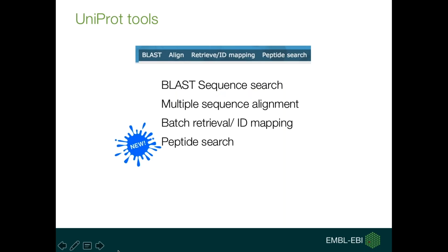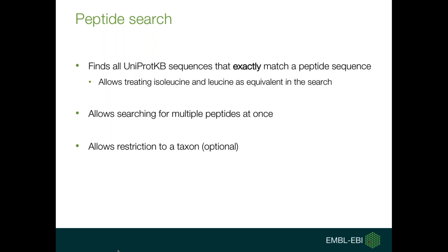Having set the stage with this introduction about proteomics data in UniProt, I'd like to move on to the novelty of the peptide search tool that we've added recently to our website. This tool is added to the small complement of tools that we routinely present on the UniProt website. You find it in the top-left corner of any entry on the UniProt website. It allows you to find all UniProt knowledge base sequences that exactly match any given peptide that you submit to that search.